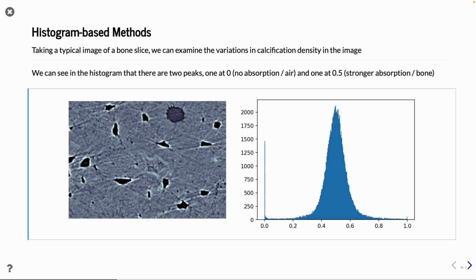If this data wasn't cut in the way it was in the gray levels, you see this very high peak, you would probably see a little bump over here. But this is the way we got the data, so this is what we have to work with. I would say a first attempt would be to put the threshold somewhere between 0.1 and 0.2.